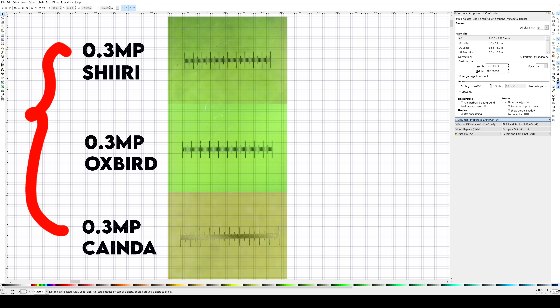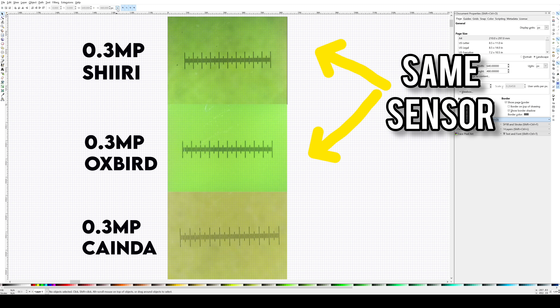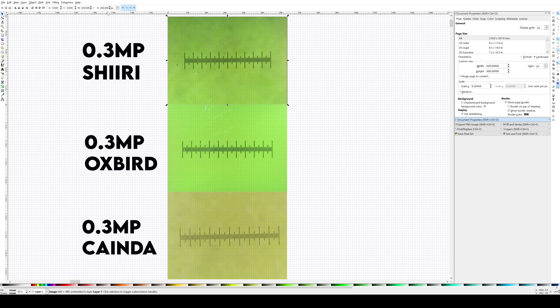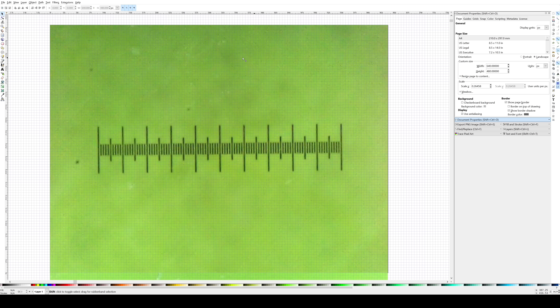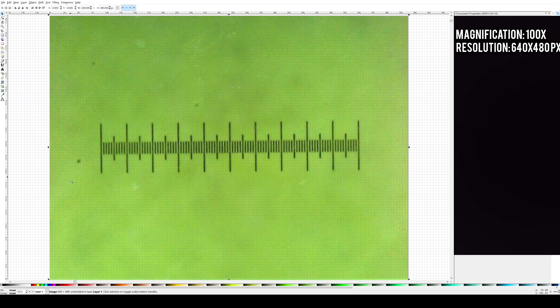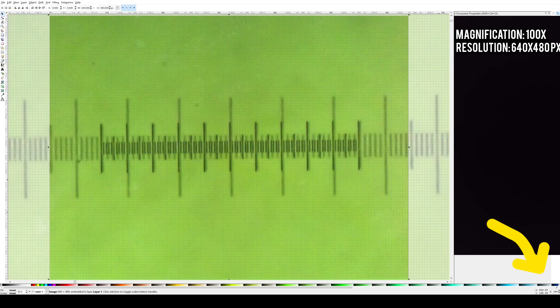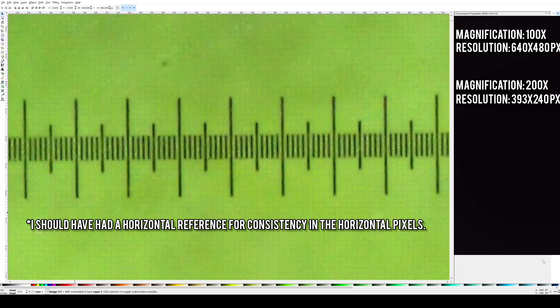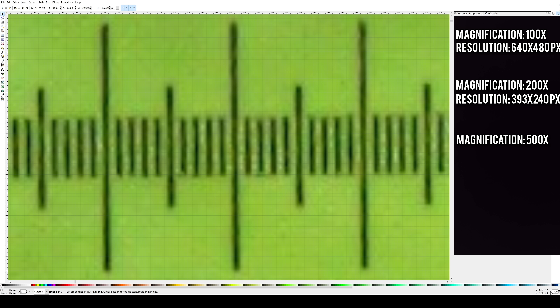Let's start with the 0.3 megapixel sensor digital microscopes. From my teardowns, I know that the Shiri and Oxbird both use the same sensor, so it's no surprise that they look similar. Making sure that the display units are set to pixels, I can confirm these are 640x480 photos. Based on the comparison from the previous video, I determined that this microscope produces images at roughly 100x magnification. That means our starting values are 100x magnification and 640x480p resolution. Doubling the magnification increases it to 200x but decreases the resolution by half to 240p. Increasing the magnification by 2.5x results in an effective magnification of 500x and reduces the resolution further to just 96 pixels vertically. Doubling it once more to 1000x means the resolution has also been reduced 10x. Our final image is very blurry and not well defined.